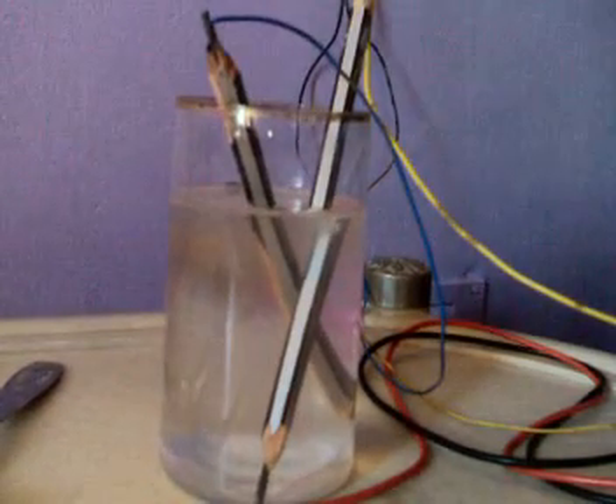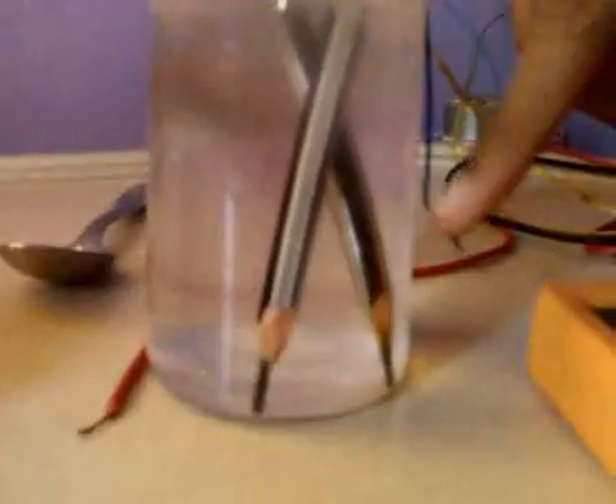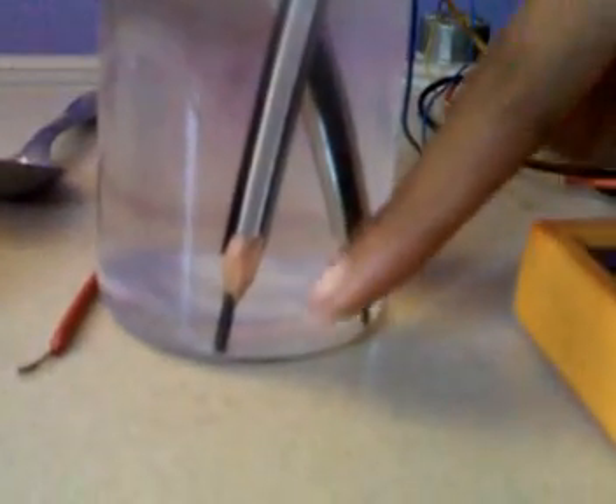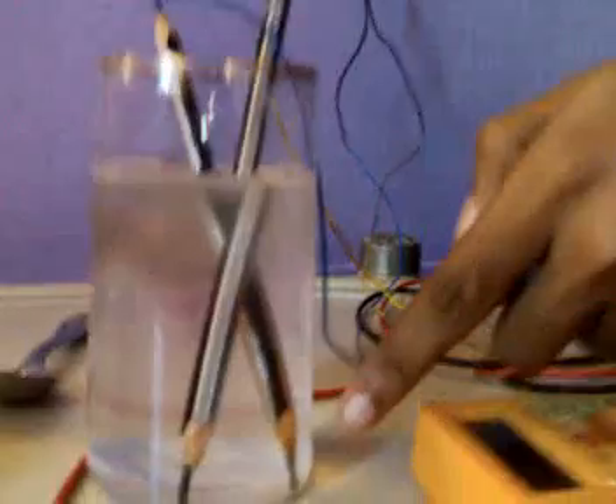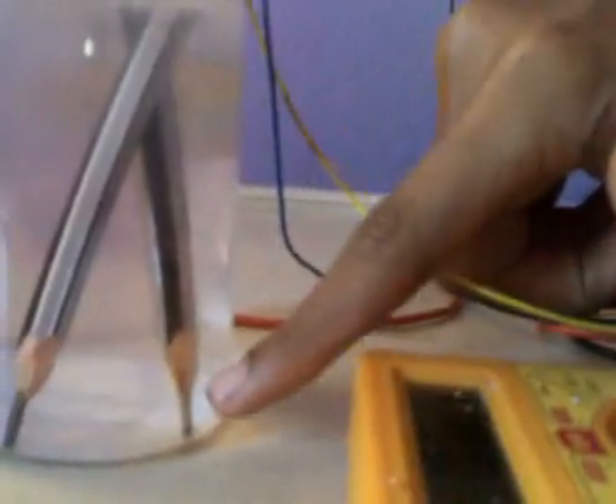Now you are going to switch on the power supply. Observe the ends of the pencil carefully — right now there are no bubbles. Now when the power is switched on, you can see the bubbles developing. This shows that electrolysis is in progress.